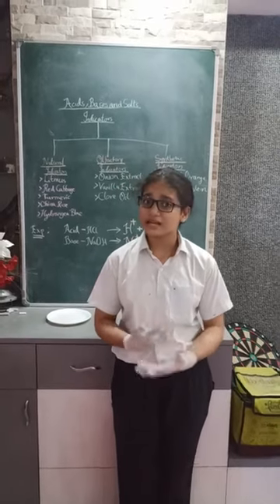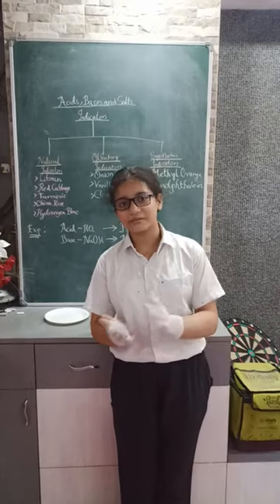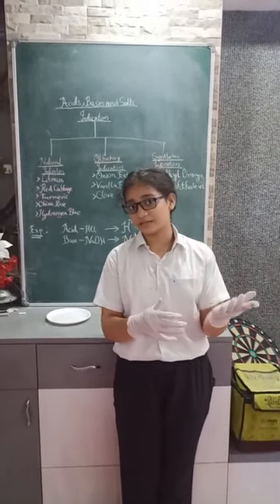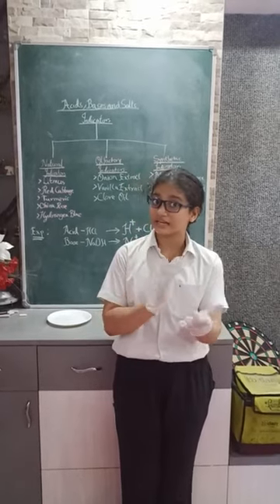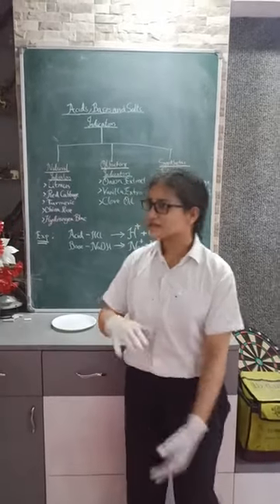Today I will show you some practical experiments which show how different indicators react with acids and bases. But first of all, you may need a pair of gloves for your safety, because some acids are very strong and some bases are also very strong and can damage your skin. So right now, let's get into the details.